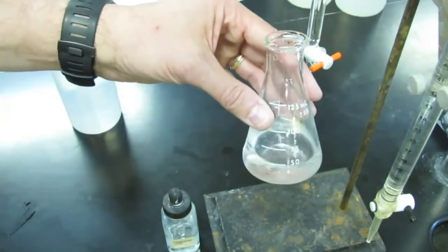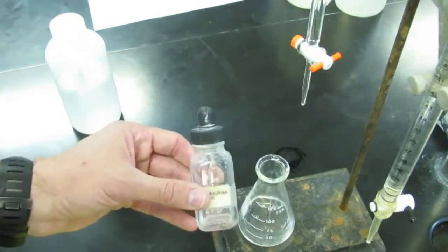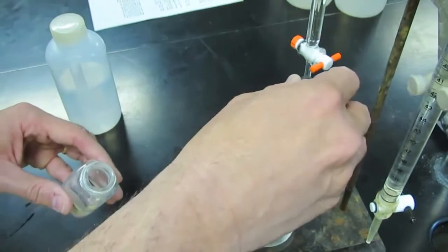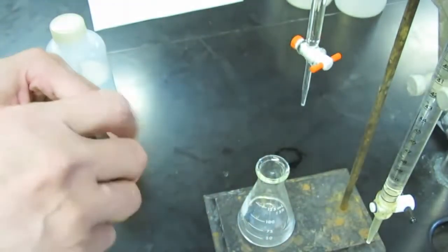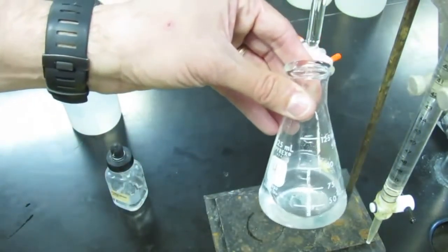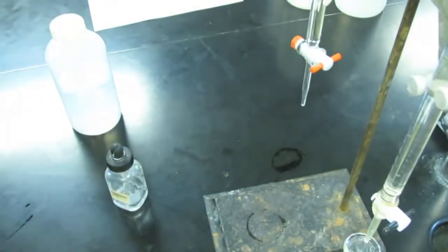Now we need to neutralize this with my sodium hydroxide. So to do that, we're going to add 2 drops of our phenolphthalein indicator. Phenolphthalein, as you know, is colorless in an acid solution, and it becomes bright pink in a basic solution. So you'll see, obviously, we have an acid solution here. We'll put that underneath our base burette, and we will start titrating.